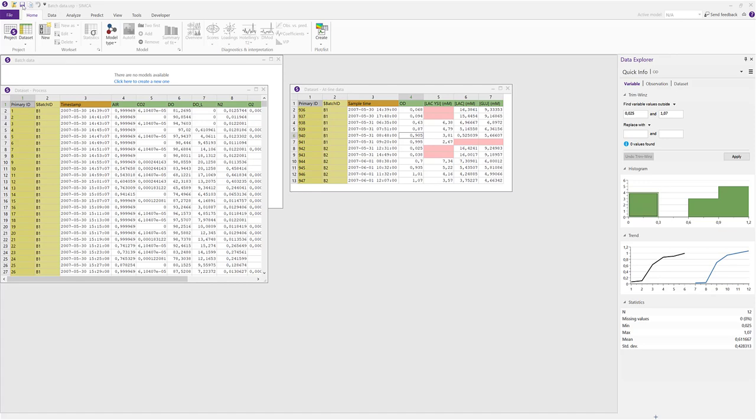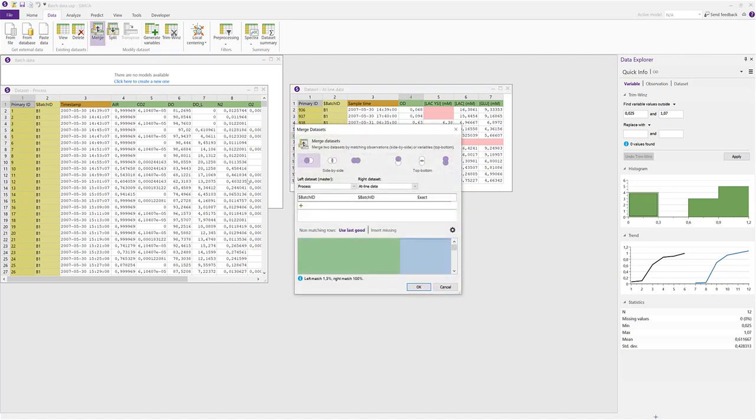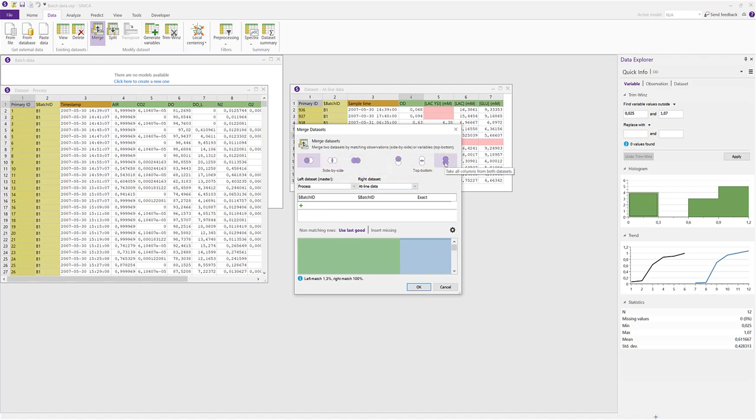The new merge functionality is located in the data tab together with other data set modification tools. We can see that we have three different options for side by side and three different options for top bottom. The first option for side by side merging is where one of the data sets, the left one, is a master data set and will be kept intact. The right side data set, the slave, will be merged into the master data set.